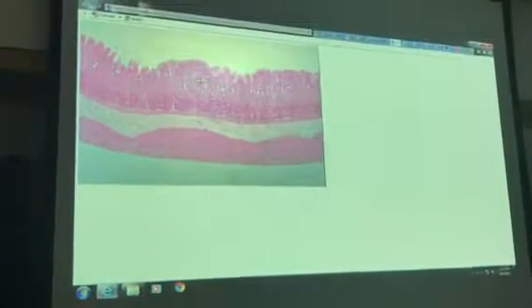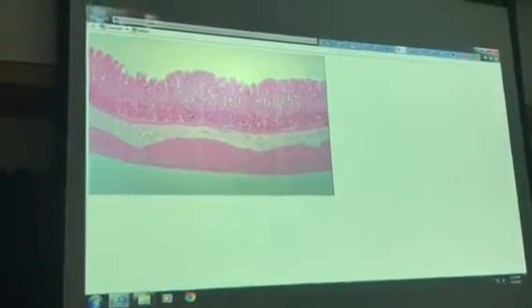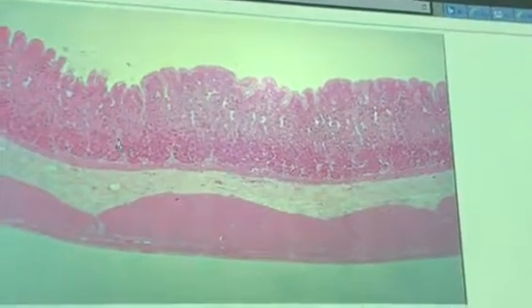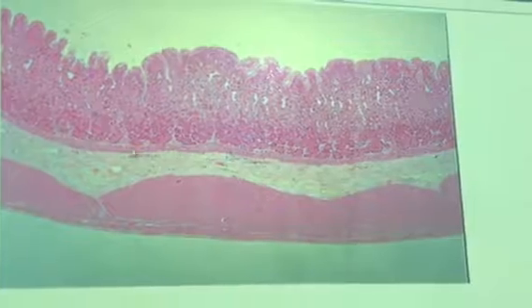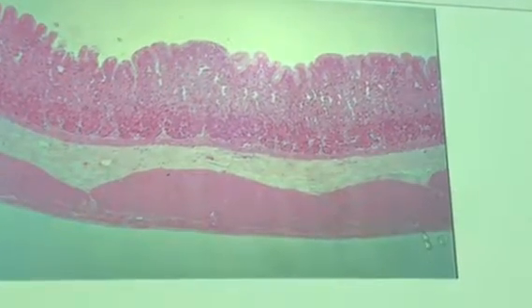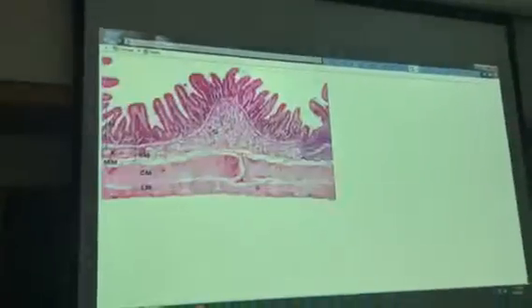More stomach. So, okay, gastric pits up here. The circular things at the bottom are the gastric glands. It's kind of tough to see the lamina propria, but it's basically filling in the spaces. This thin line going across is the muscularis mucosae, submucosa, muscularis layer, and then this thin thing just on the outside would be the serosa.